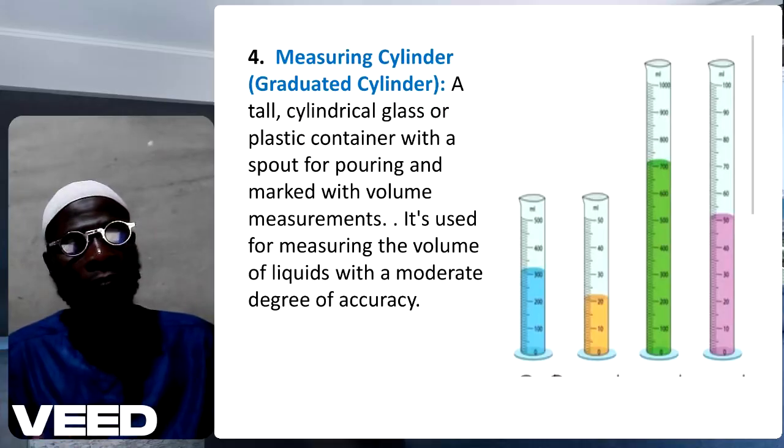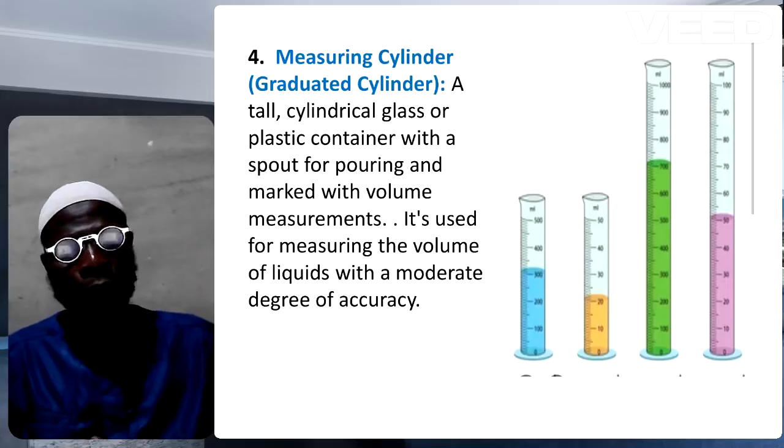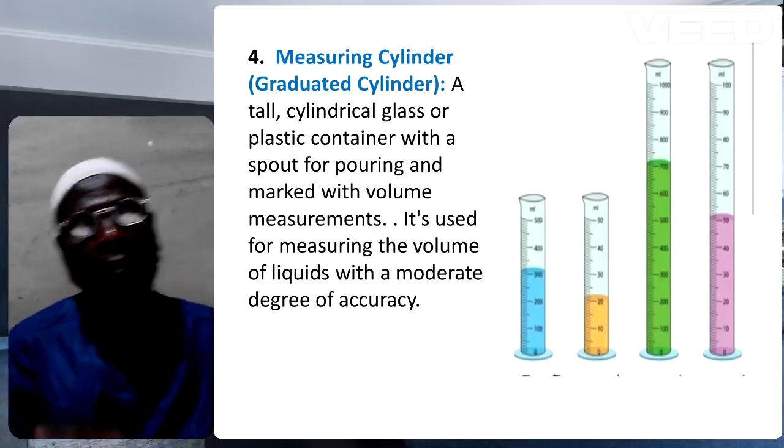We have different sizes of measuring cylinder: 10 milliliter, 20 milliliter, 25 milliliter, 50, 100, 1000, depending on the measurement you want to take.